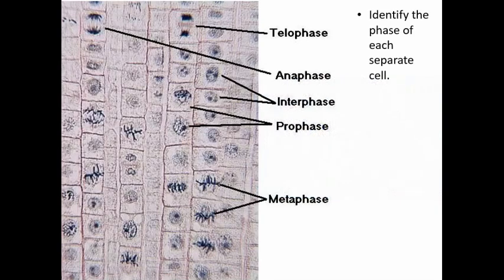In this lab you'll identify the phase of mitosis of each separate cell. Here you can see that cells are going through the first stage of mitosis, prophase, where the chromosomes condense. They go through metaphase where the condensed chromosomes are meeting at the middle of the dividing nucleus. At anaphase the separate chromosomes are being pulled apart. At telophase the cell is almost finished dividing and we almost have two new cells with their own individual genetic material.